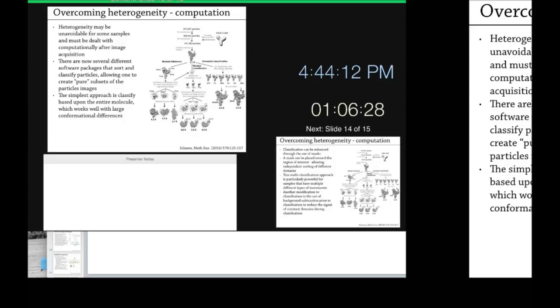Yeah, I think right now cleaning up picking is the slowest part of the procedure. Auto picking works great in some cases if you have a really clean grid. If you have something that's aggregation prone, or you have DNA, which can cause a beads-on-a-string sort of thing, then it can be a real mess. And so as a reader, looking at the individual images, particularly if they can show you a representative set of the particles they picked, that can be helpful.